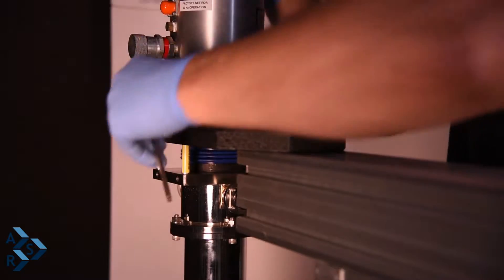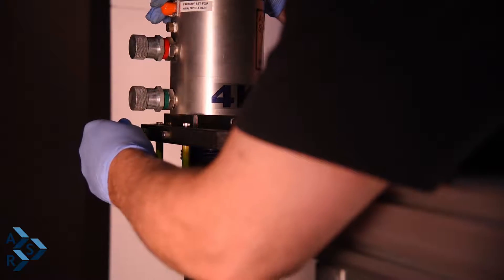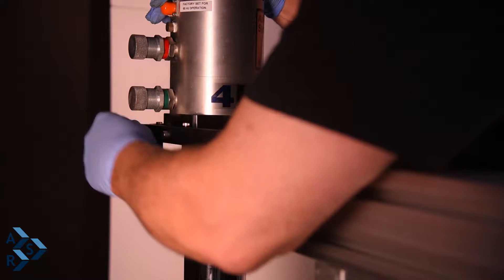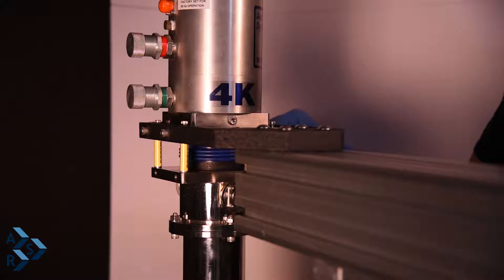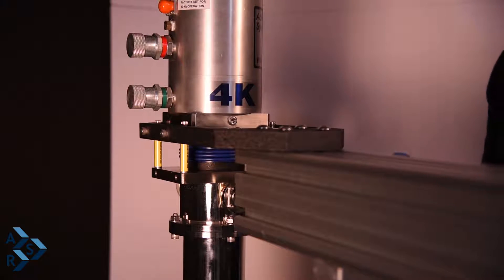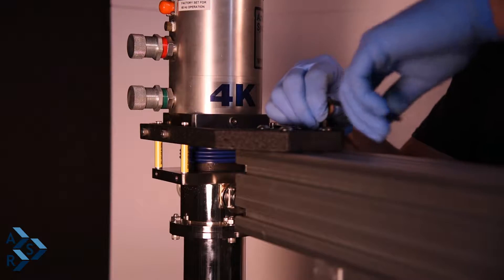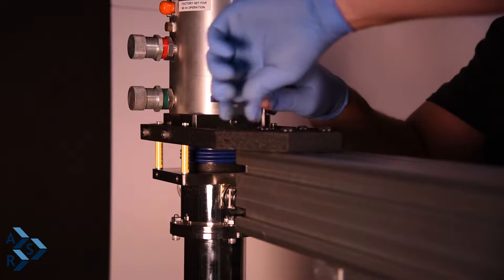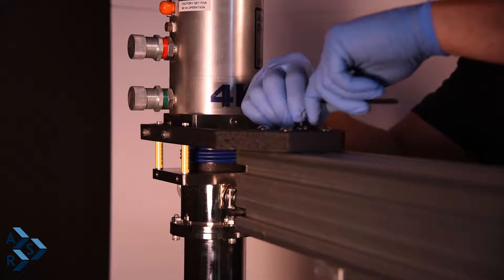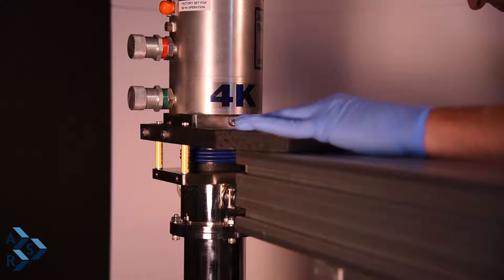This is a three-sixteenths Allen key that you're going to use to tighten down, finishing tightening the quarter-20 screws to the interface. Go around and make sure that they are nice and tight. Make sure your height is good — it takes a little bit of time. Then go ahead and screw these down tight to your stand once you have it all set up. Snug them down and make sure they are tight.